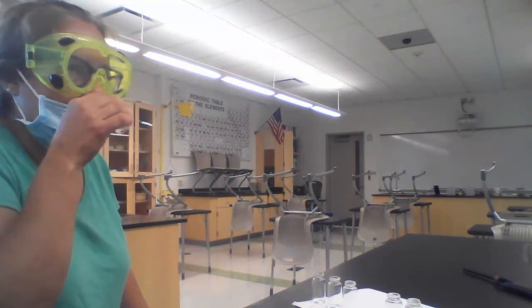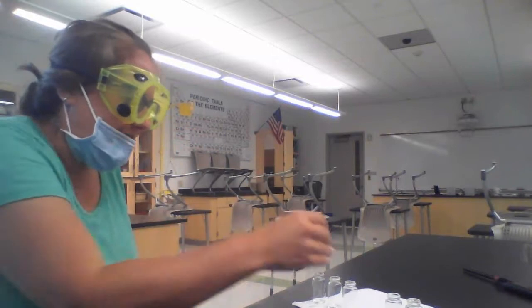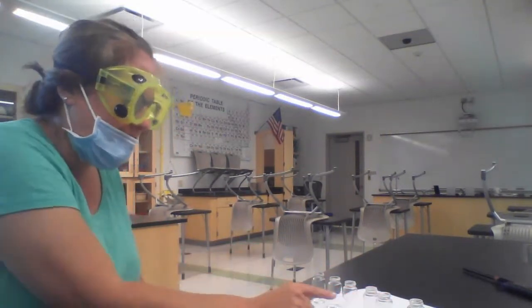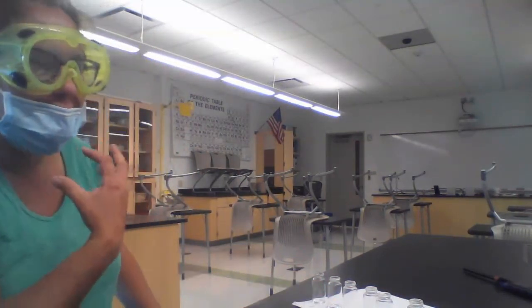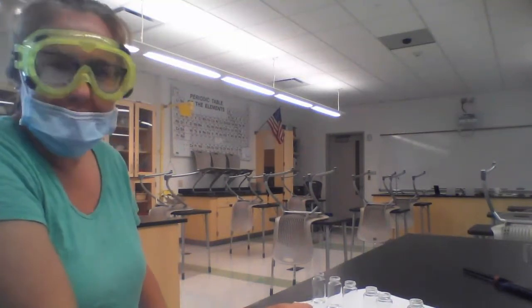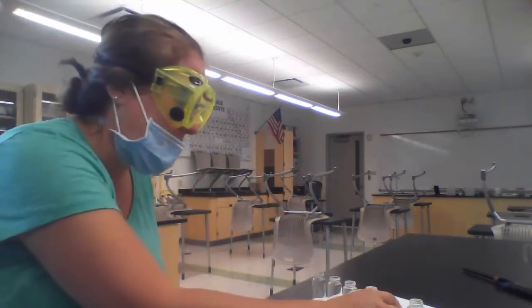Number 4 has a much lighter smell to it. Faint, maybe? A faint odor, but almost odorless. Okay. And I think my smell was coming from the strongest one, like a residue from the other. Notice that she's worried about sort of cross-contamination, which can happen. Yeah, I think that if I had waited a little bit longer between smelling them.